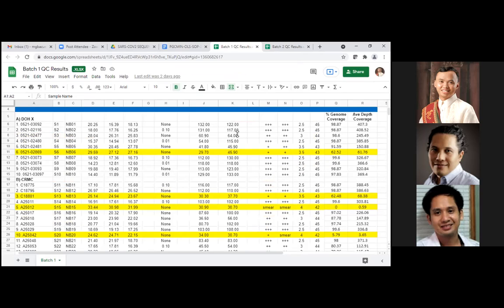Yeah. So if you look at this one, this is a qualitative band assessment. So 3+, if it's very clear and bright. But this is subjective. This is dependent on the analyst. So it's better if we look at the Qubit reading. So for instance, if you look at these samples, which we were not able to sequence successfully, we only got very low, like around 30 to 40 PCR amplicons post-enrichment. But yes, we were not able to sequence.